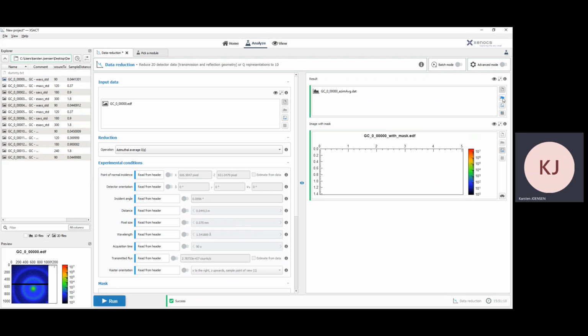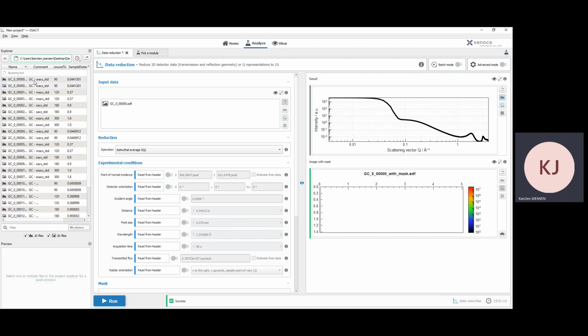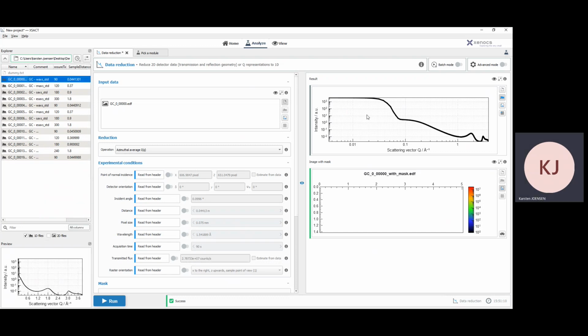So that's what we can visualize as that curve, and we could in principle take the 1D curve of that same file, file 0 1D curve, and throw it in there to see. Actually, they are very, very similar, those two measurements. That was a simple thing, and of course they should be the same because they're using the same information.